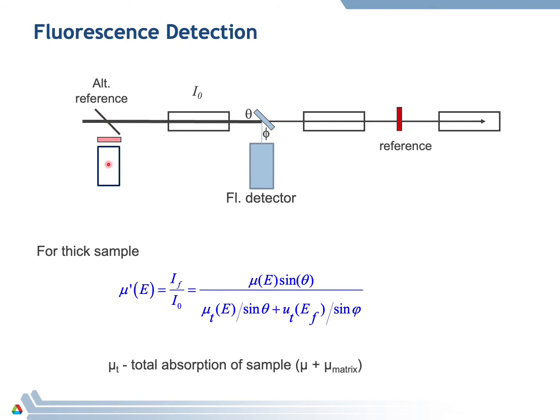The edge will be a little bit distorted when you measure it in this method, but it's still quite a good method for checking for shifts in the energy with time.